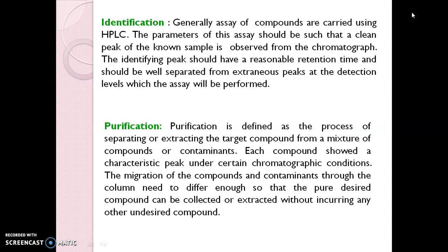The identifying peaks should have a reasonable retention time and should be well separated from extraneous peaks at the detection level at which the assay will be performed. Purification or isolation is possible with preparative columns.